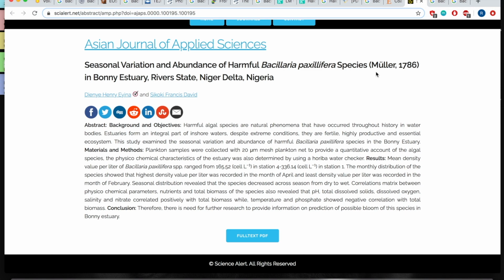There's no symbiosis with this species. It was always recorded to be attached to a sort of substratum such as rock or just free floating. And there was no record of it having a symbiotic relationship. So I'm going to annotate no for symbioses.